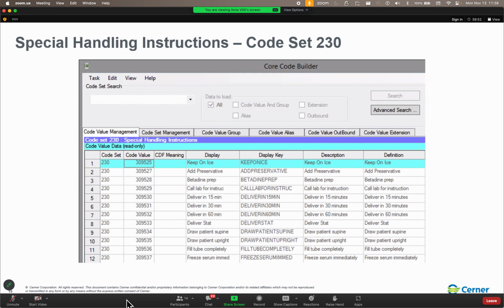For that time period between midnight and the cutoff or whatever the list is that generates at 3:30, you've got a situation where if the users use the AM draw, then it is going to default in the start date and time more than 24 hours from that point.